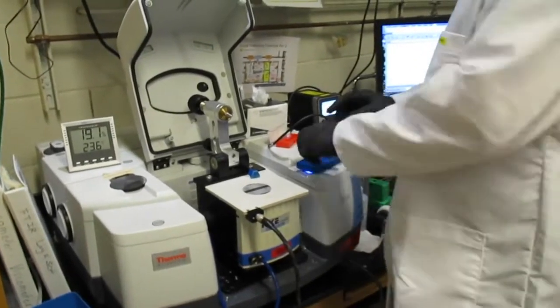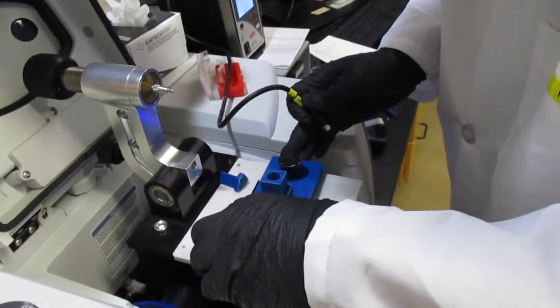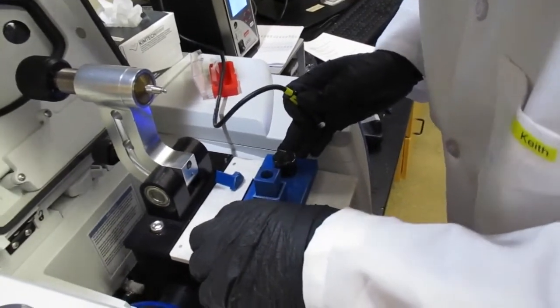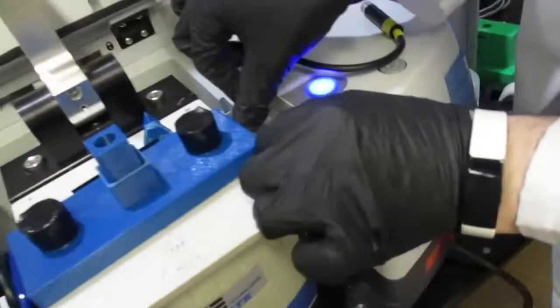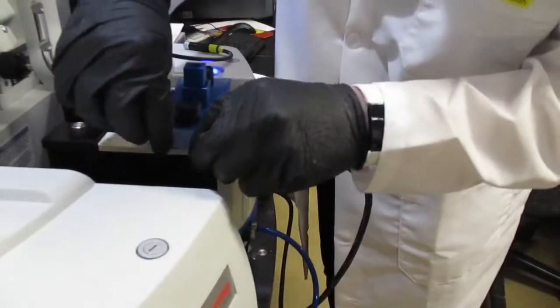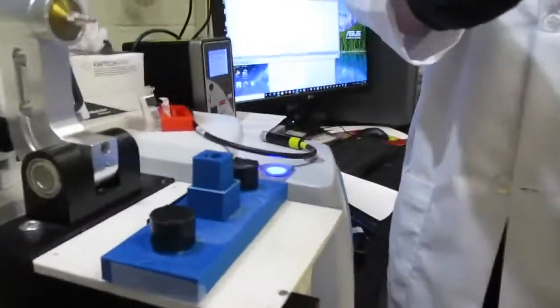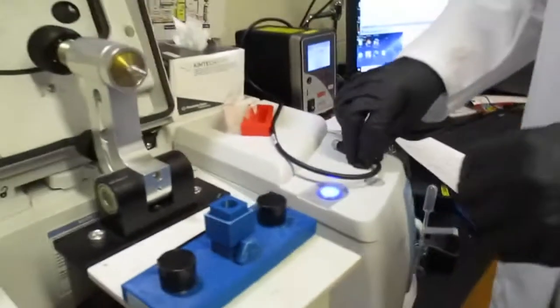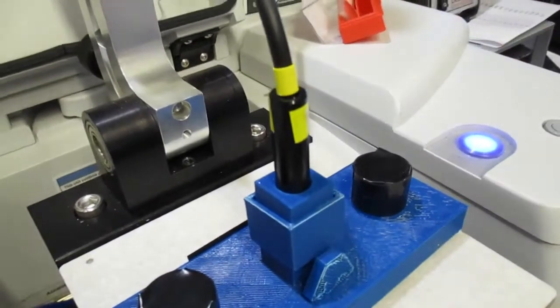Okay, so once the sample has set, you can put on this apparatus that holds our light source. Make sure you put it on top of the miracle diamond. And then I like to tape the sides so that it stays at that position as best you can. And then you're going to put the light blocker inside. Then what you can do is you can take your LED source and put it inside the aperture.